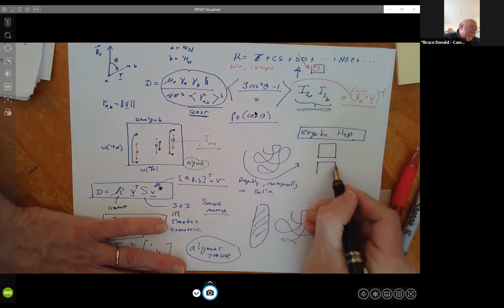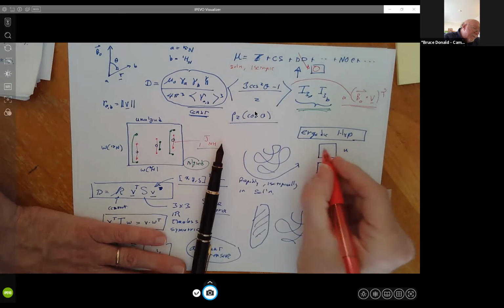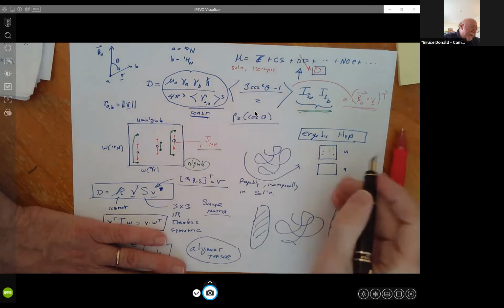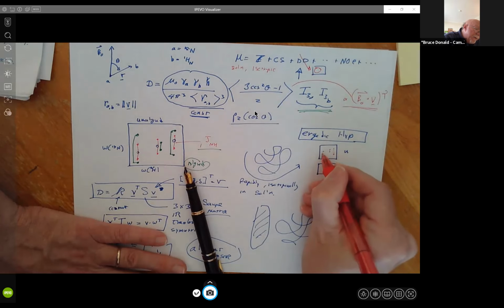So in short, your two spectra aligned and unaligned would look like this, if I can draw them. So this is unaligned and aligned. So here you would see just this. I'll try to draw it to scale. And your aligned version, and I think it's fair for me to put in the line between them.